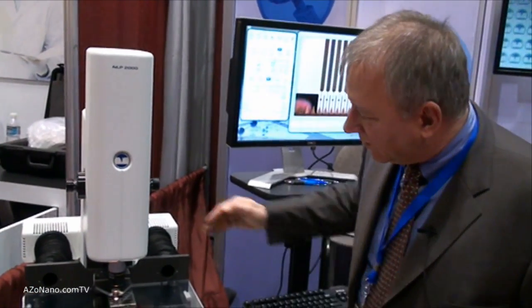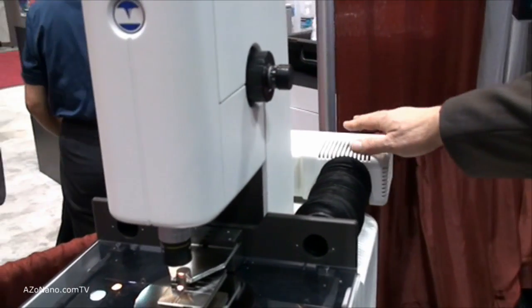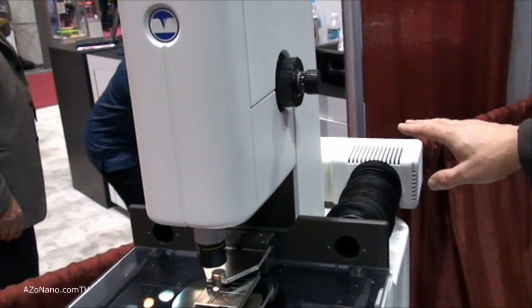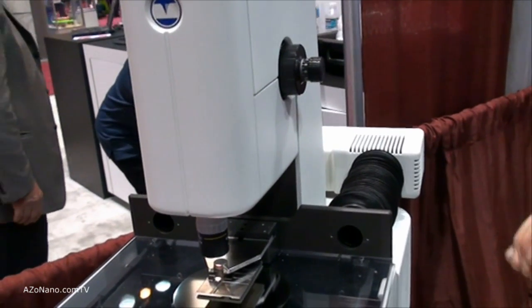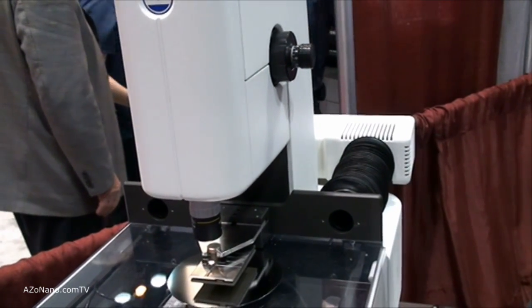And in back of this is an environmental chamber. This is the device that powers the delivery of controlled temperature and humidity.